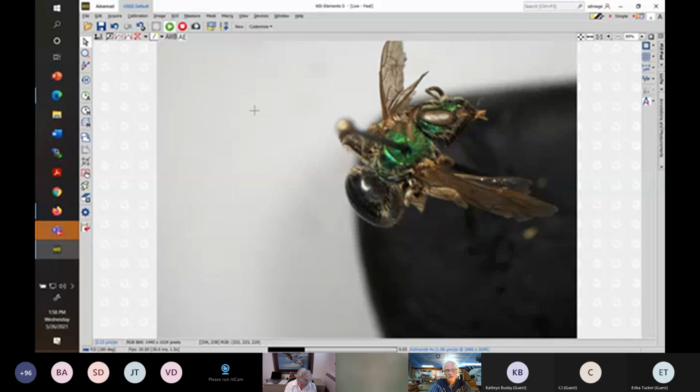I see this specimen has this feature, which I know will split out a lot of things. So you would do that. But at the same time, hopefully there's always a path to an identification of a species, whether it's a male or female. So in the Agapostemon, it doesn't matter. The males and females both have that carina.